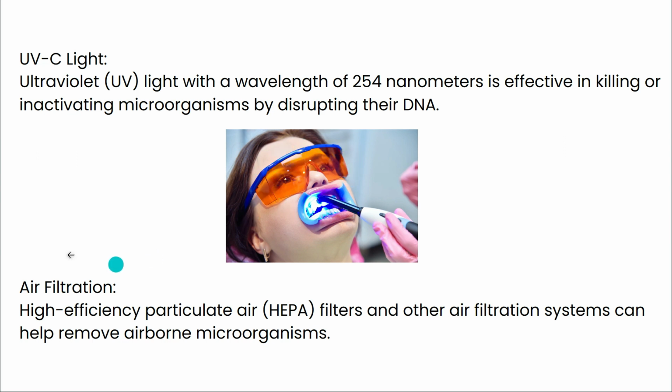Air filtration. As we all know, air carries microorganisms and other spores. Hence, in order to filter air, there are various air filtration techniques in practice using different filters. One of the best examples is HEPA filters. This is used especially in laminar airflow in order to maintain sterile conditions.